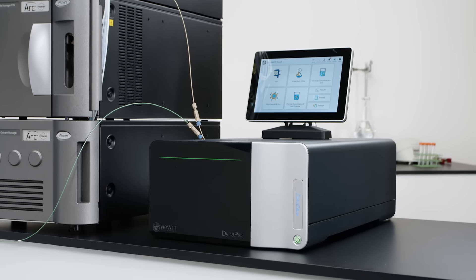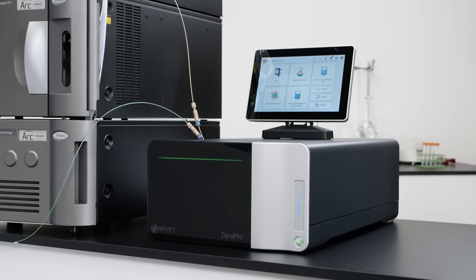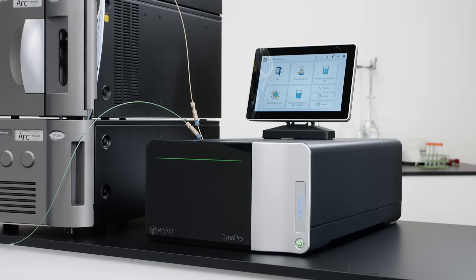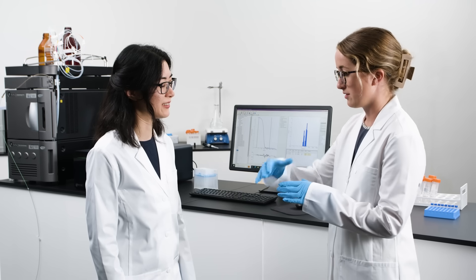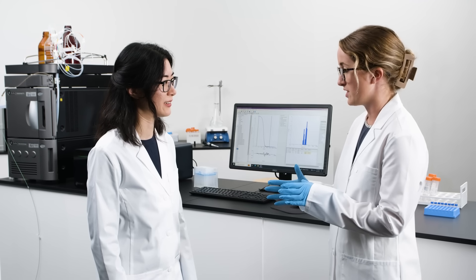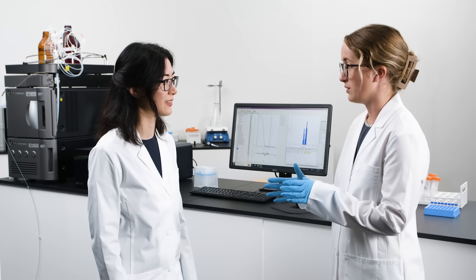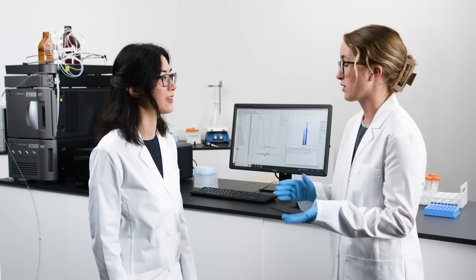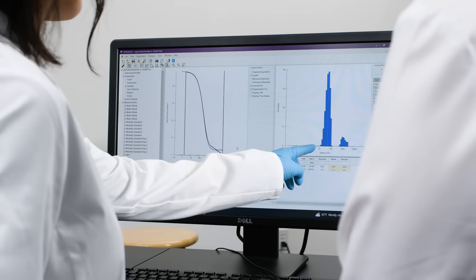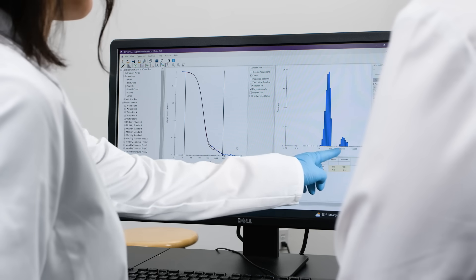Wyatt Technology's ZetaStar enables all of these workflows. It harnesses novel technology and Wyatt's deep scientific expertise to ensure that you get the answers you need.